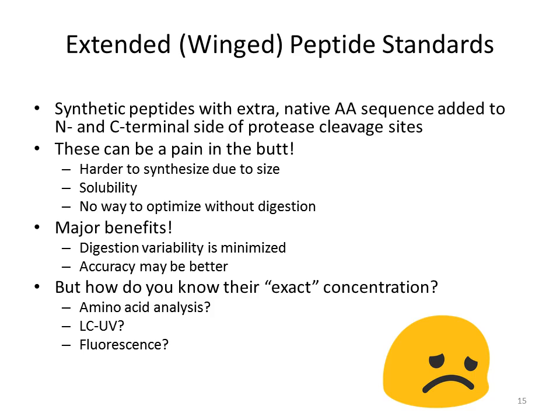Okay, this is the very first thing I had to do at my job out of undergrad. I got a job at a biopharmaceutical company making proteins, and we had to generate a protein standard. We had to get its concentration. So you have to use positive displacement pipettes to work with a solution where your analyte is in there, and you pipette out specific volumes into glass vials. You add hydrochloric acid, 6 normal, and you hydrolyze overnight, adding a bunch of other things to label the amino acids that are generated from this process.